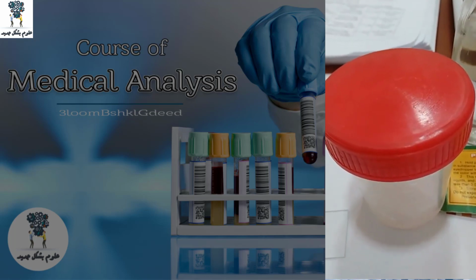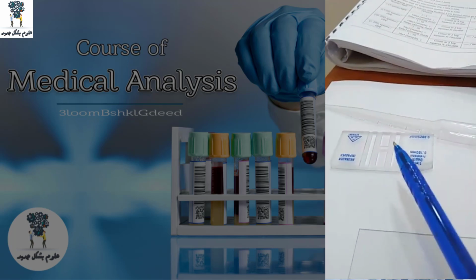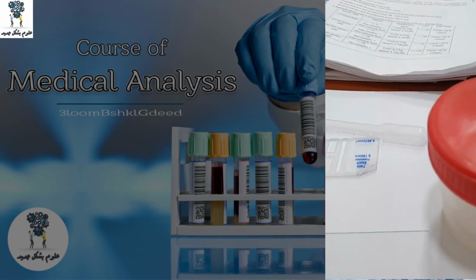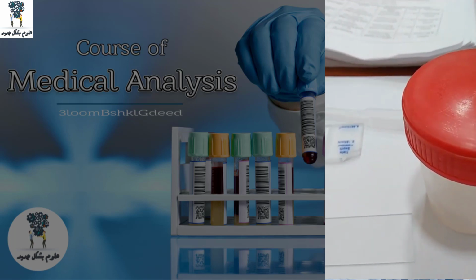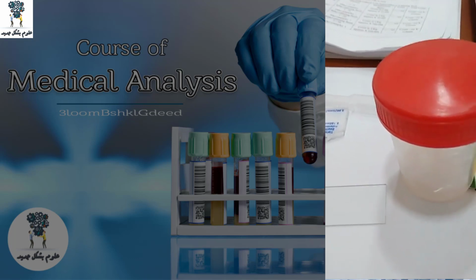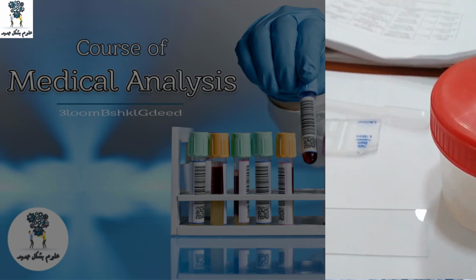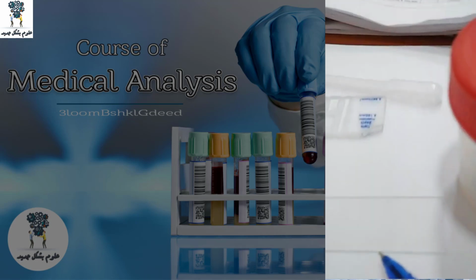If there are no sperm under the microscope, we will check directly on the slide of the counting chamber.